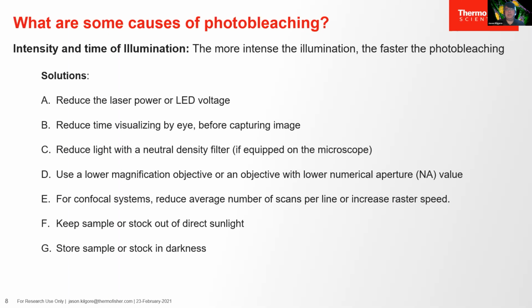In our EVOS microscopes, for instance, we have light cubes with LEDs as the light source, and you can change the voltage or intensity of those LEDs. So if your dye is photobleaching, you want to reduce that intensity and maybe increase the gain setting to get a more efficient capture from the detector. For confocal systems, you can lower the laser power and voltage. The trade-off, of course, is by limiting your exposure, you're also limiting the signal to background, right? So that's always a trade-off there.